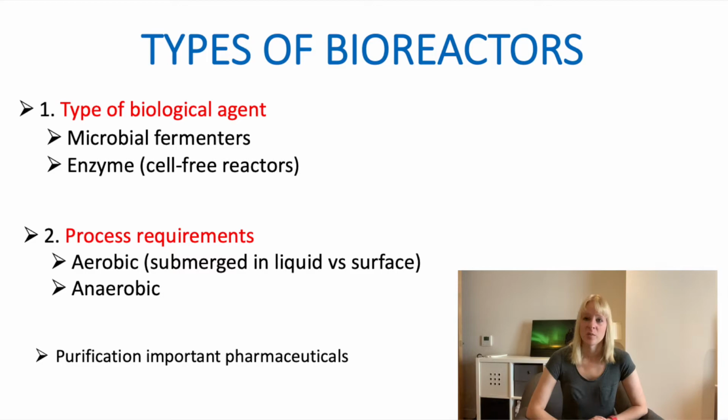When it comes to the key design challenges, it depends on the type of bioreactor that you have. And we roughly discriminate between two different categories. The first is what type of microorganism you're working with, or whether you're working with enzymes, for instance. If you're working with particularly small microorganisms, these are quite sensitive to shear. So with those, you have to be a lot more careful in how you distribute. Imagine if they need oxygen, you can't have your impeller on at full speed, it doesn't work.